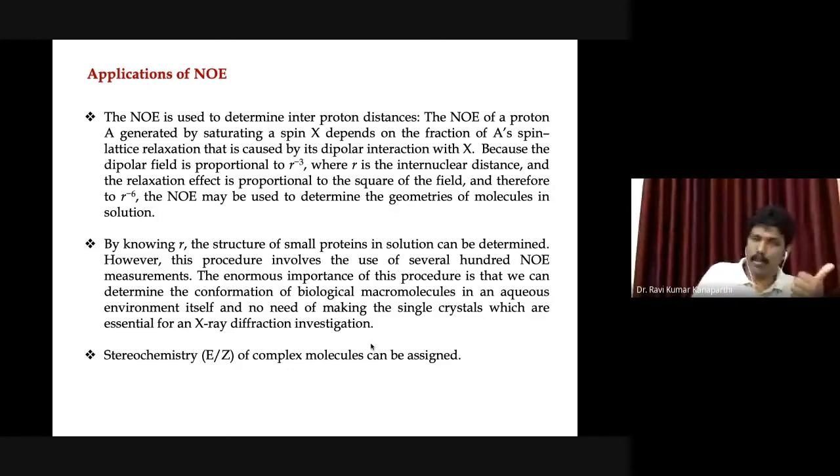Okay, that is one thing. The second point is that it gives you direct solution phase molecular structure. So that is highly appreciated because the molecule present, that is also the protein, is present in an almost similar structure to that in human cells or any organism cells. So that is the beauty of the NMR technique.